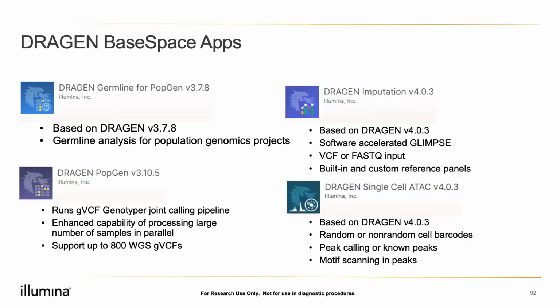All right, I now want to just provide an update to some of the new apps that are coming to BaseSpace for DRAGEN. So some of these are specific to the DRAGEN version 4.0 release, but a lot of these are kind of independent of DRAGEN version 4.0 and I just wanted to make you aware of some of these changes and new apps that are available.